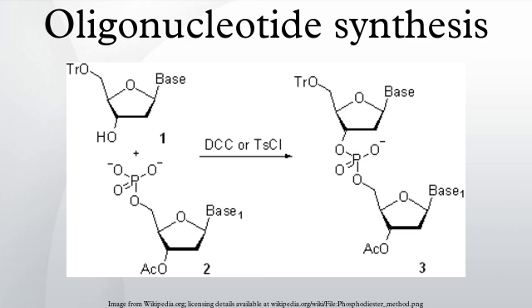The 5'-terminal 5'-hydroxy group is protected with DMT group. The internucleosidic phosphate or phosphoramidite moieties are protected with 2-cyanoethyl groups. The exocyclic amino groups in all nucleic bases except for T and U are protected with acyl protecting groups. To furnish a functional oligonucleotide, all the protecting groups have to be removed.